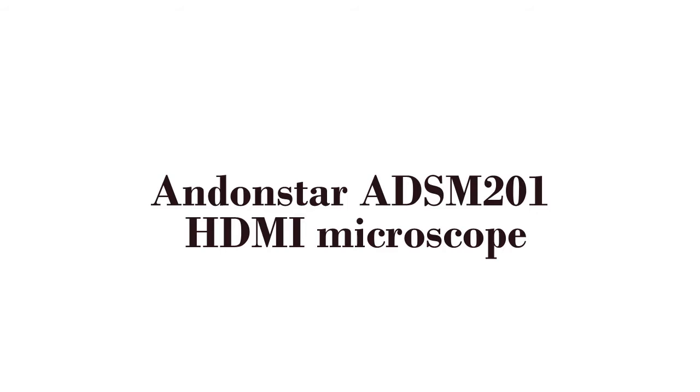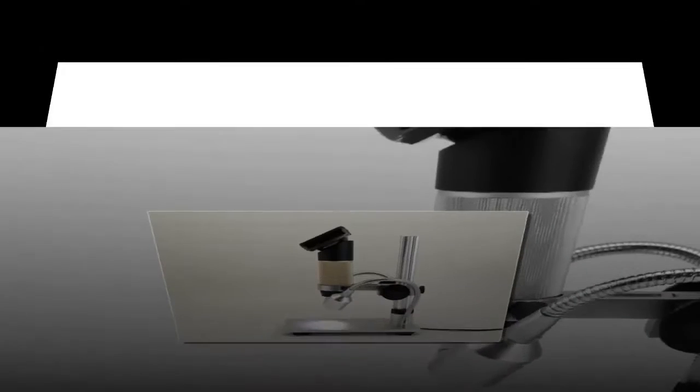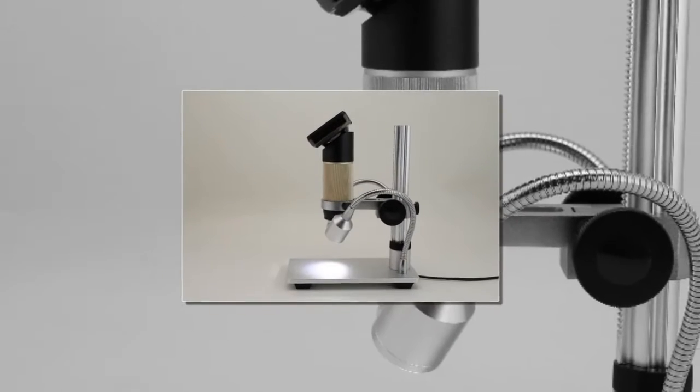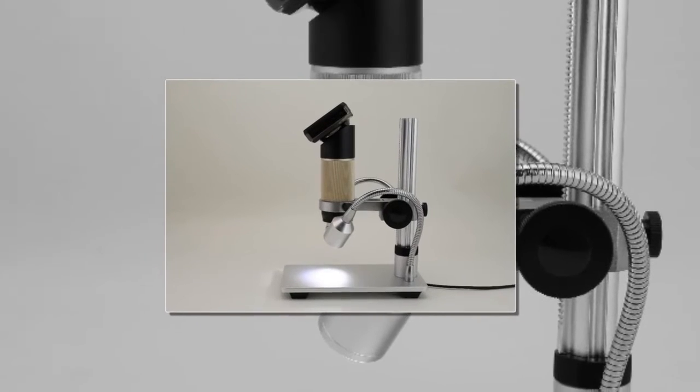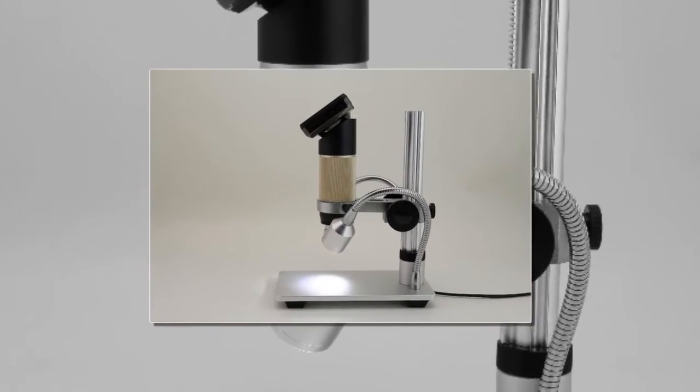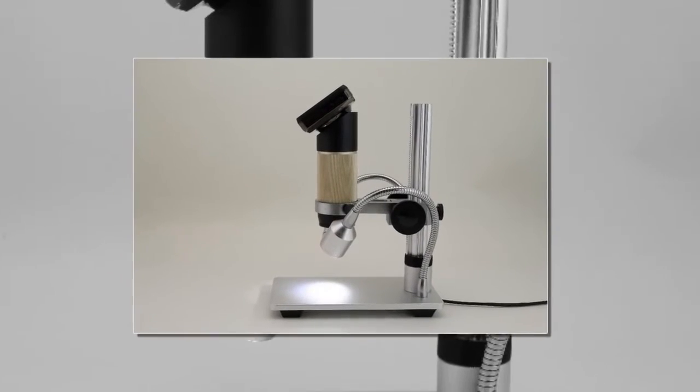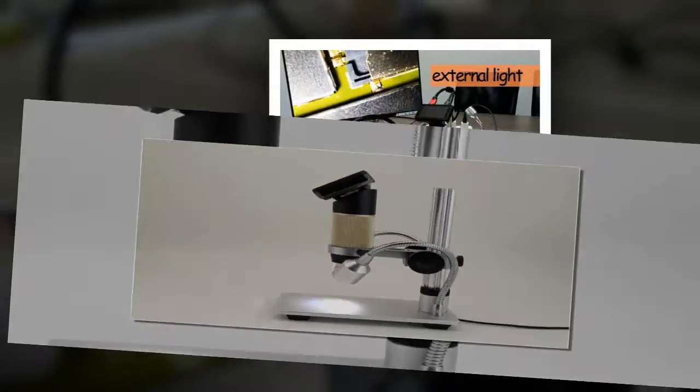Here is product number 2. Andonstar ADSM201 HDMI Microscope. Image Sensor: 3MP. Video Output: 1080p Full HD.